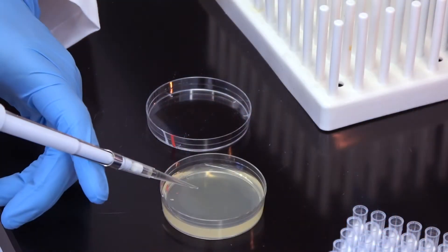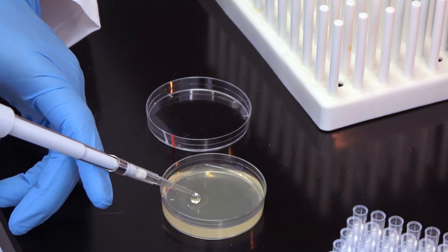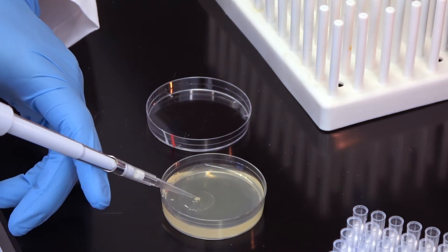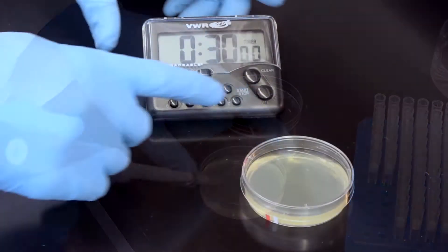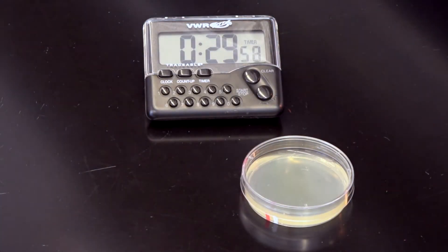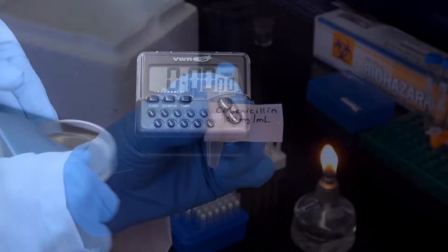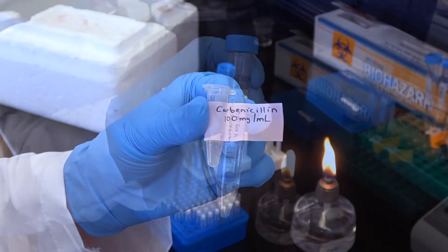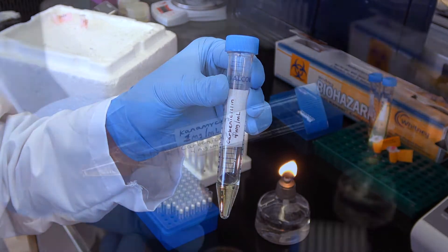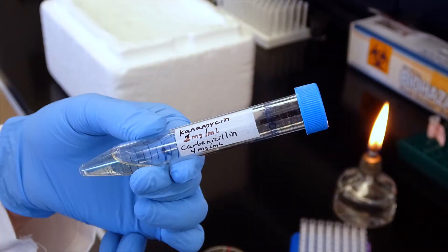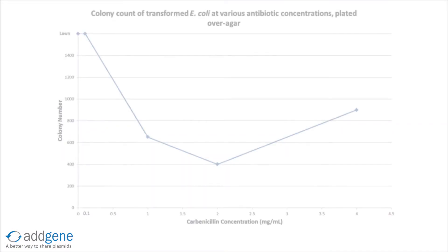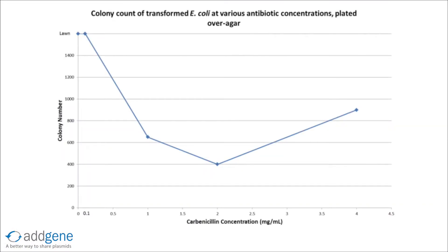In this method, we pipette the antibiotic we need onto a pre-poured LB agar plate, spread it, and let it sit so the antibiotic can diffuse throughout the plate. While we'll specifically focus on selection with carbonicillin in this video, this method can be adapted for any antibiotic once you've determined the optimum concentration via a selection curve. Please see our protocol page for a detailed description of how to make your own selection curve.